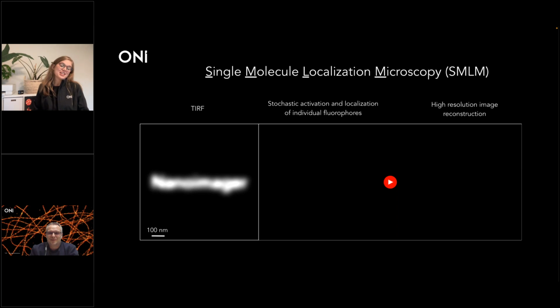Thank you for this very interesting example. And I want to stop for a second to ask if there are any questions about the basics of single molecule localization microscopy or dSTORM. Since yesterday we covered most of this, we are going to keep the sections short and dive right into application afterwards. So are there any questions about SMLM at the moment? If not, don't be shy and just leave us your questions in the chat and we will make sure to incorporate them in our conversations.